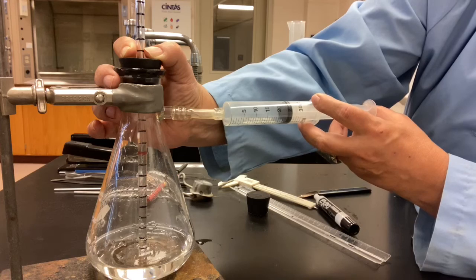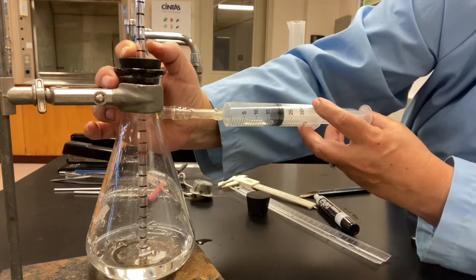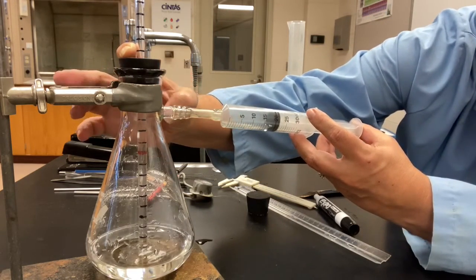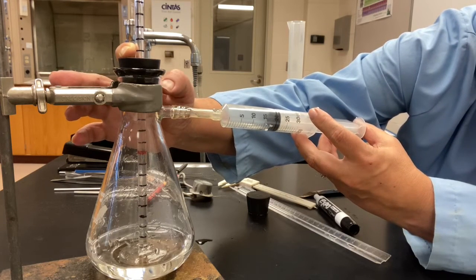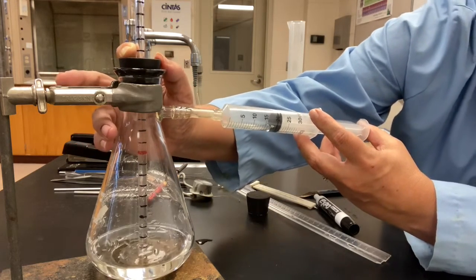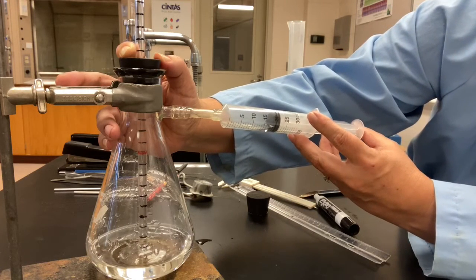Now we go to 20. And at this point, the water level is hidden by the cork. It's gone inside the center of the cork. So I would put down 17, but that value might be a little bit off. But put down 17 for the syringe level at 20.